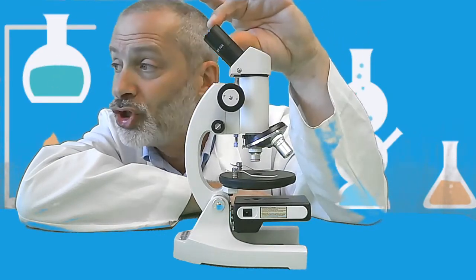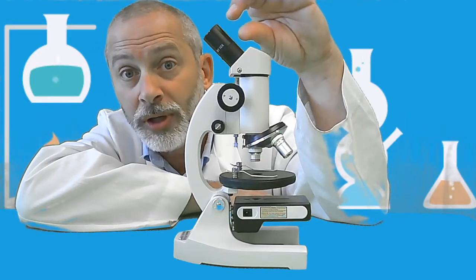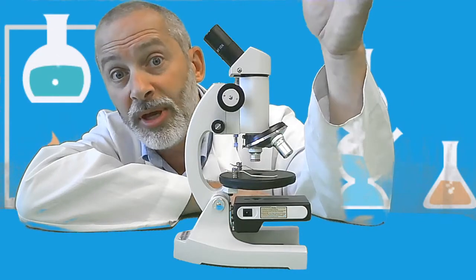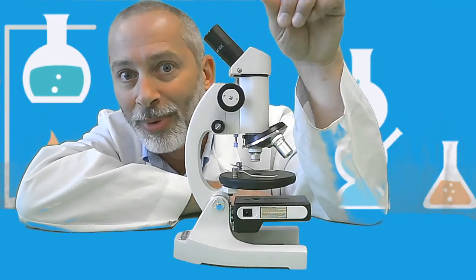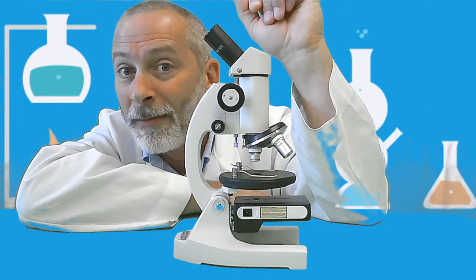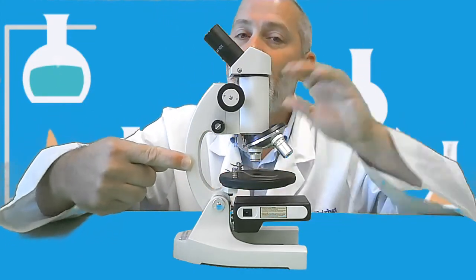So if you were to use just the eyepiece lens by itself and look through it, what you are looking at would appear 10 times bigger. So that's pretty powerful in and of itself. But we're not done yet. So let's check it out. Next part of our microscope, this part right here. What is this called, everybody?